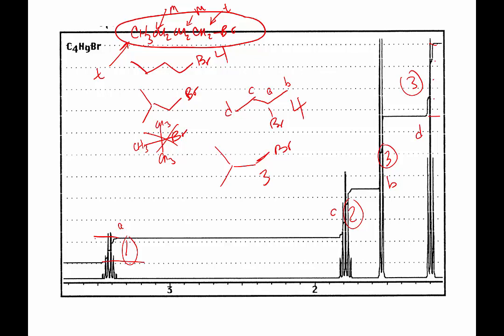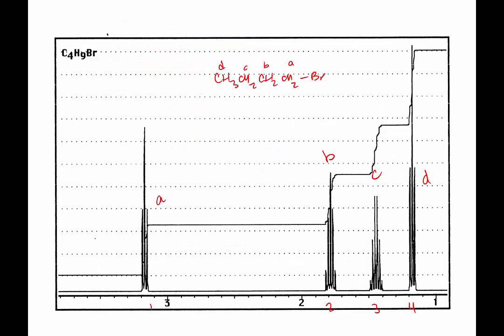Okay. What I was doing was, so this is 2 blocks. This one's 2 blocks, right? This one is 1, 2, roughly 2 blocks. And then this was 3 blocks. And that's proportional to the protons. So what you do is you divide by the smallest number.